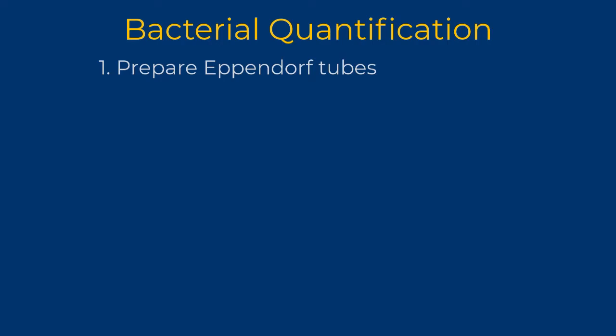To do this, you will first add TSB medium to Eppendorf tubes, then collect a sample and put it in the first tube.